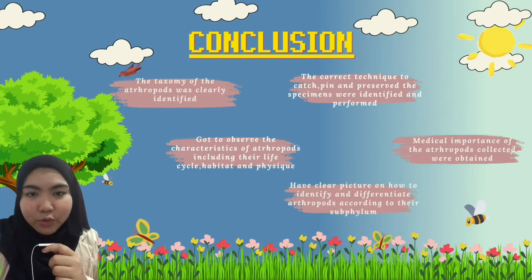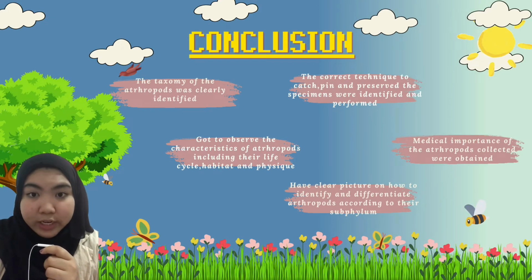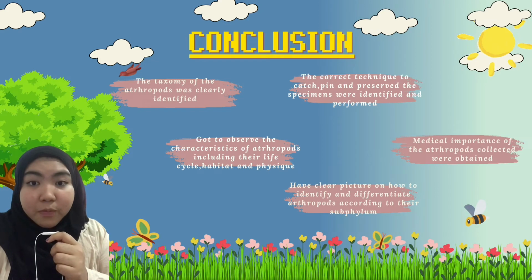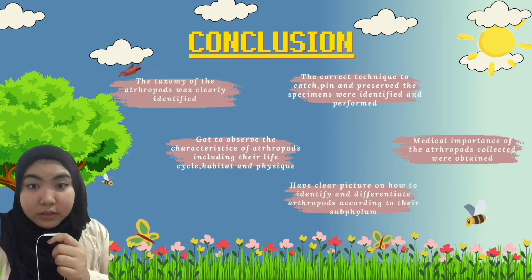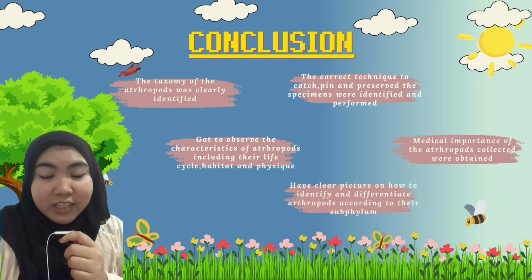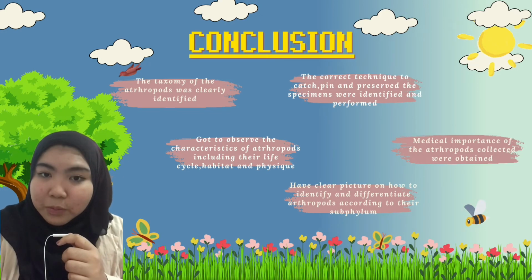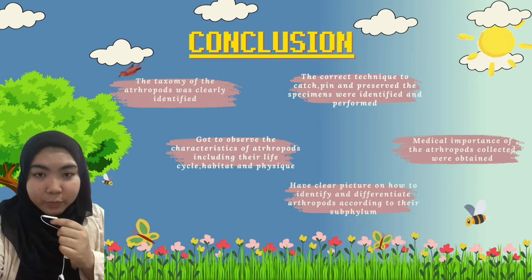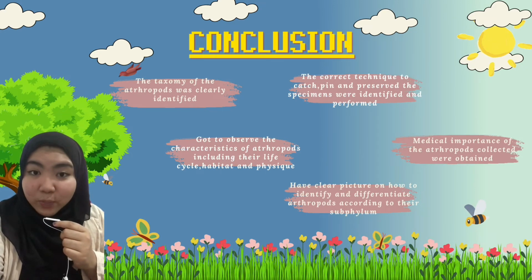So in conclusion, we have a clearer picture of how to identify the arthropods and how to differentiate them from the other subphyla, and we got to observe their characteristics and their taxonomy classification. Other than that, we were able to perform the correct techniques for catching, preserving and labeling the arthropods.